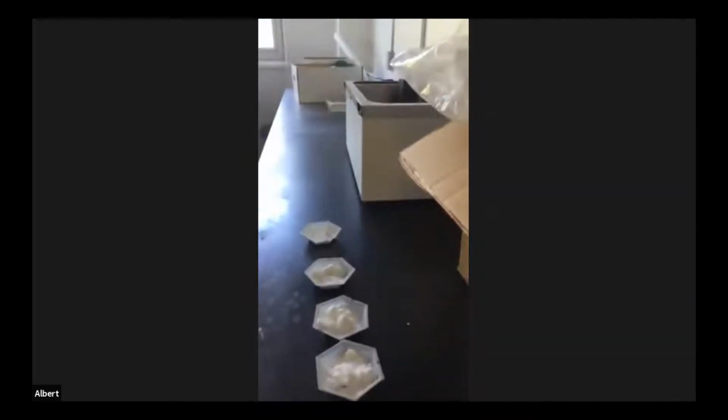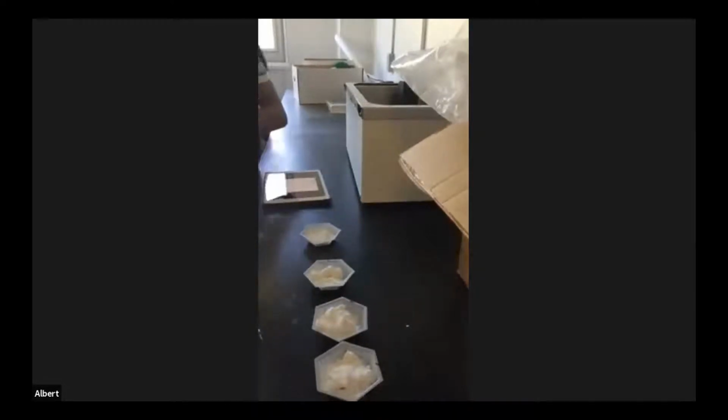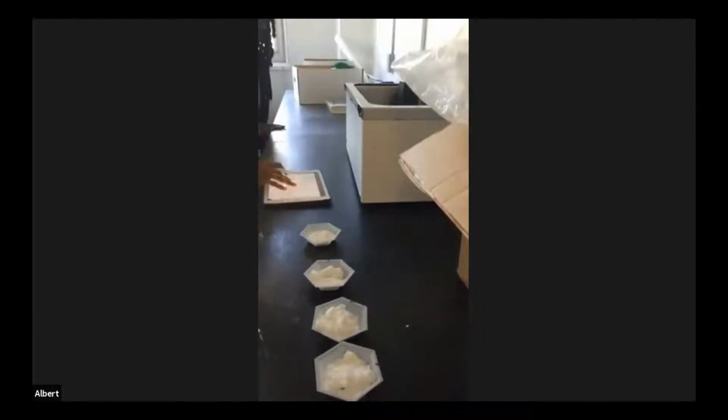So we'll do this second, but we'll do the NMR first. So let me show you what we're going to do. All right, I have our samples over here. We're going to do 3 samples, and then we're going to do the crude, because what the NMR is going to tell us is whether or not there's any junk left in our sample. We can kind of anticipate that because we already had the iron chloride test, and 2 of the samples were not so hot. 1 of them was excellent. And so we're going to find out today if there's any leftover acetic anhydride or any unreacted salicylic acid. We'll be able to see that in the NMR.